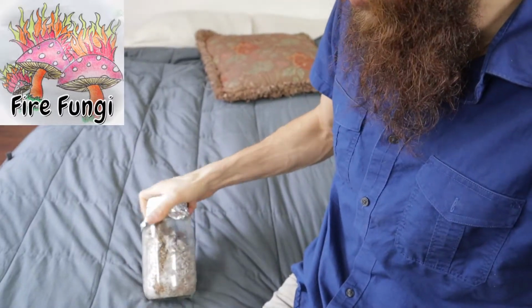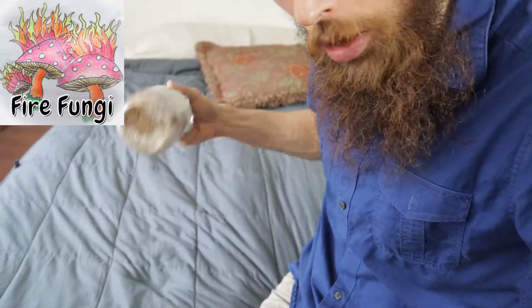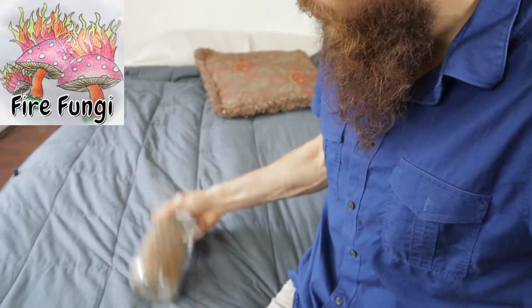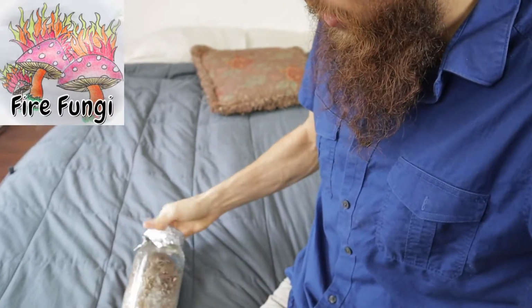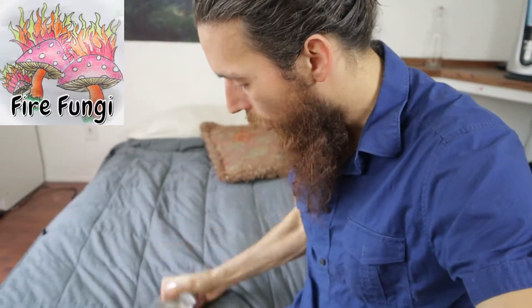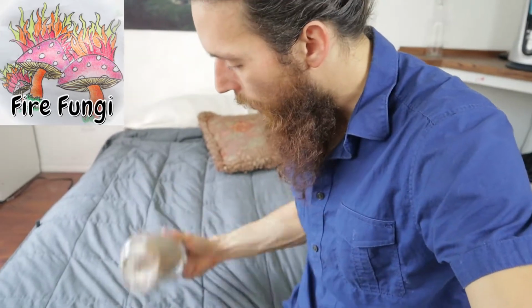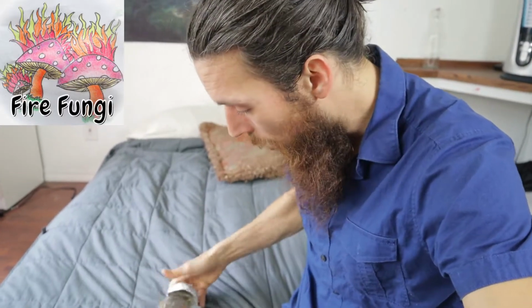Actually, it seems to be working just fine. And you don't want to wait too long to shake it, because then it's going to be a lot harder to break up. And we did put gypsum in here to ideally be helping with the breaking apart of the grain. But yeah, let's just go ahead, get this all broken up, and then we'll be in good shape, and then we'll let it finish colonizing and we'll go from there.